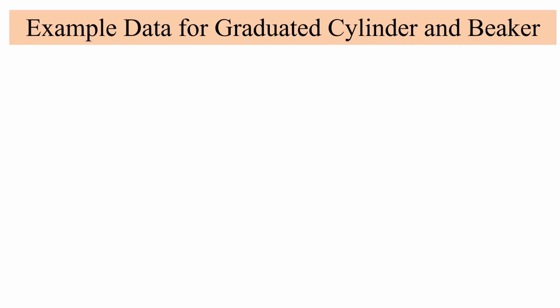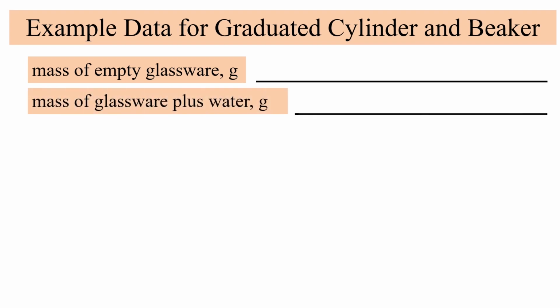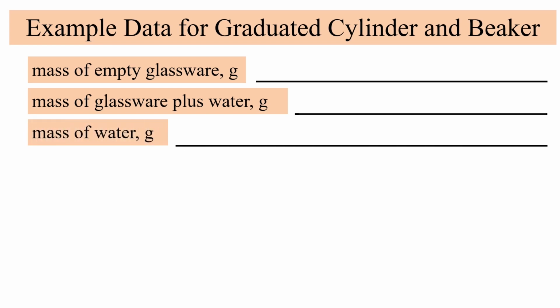Here's what the data section will look like for testing the graduated cylinder and the beaker. We'll measure the mass of the empty glassware first. Then add anywhere from 20 to 25 milliliters of water to the glassware and measure the mass. We can subtract the mass of the empty glassware to get the mass of the water by itself.